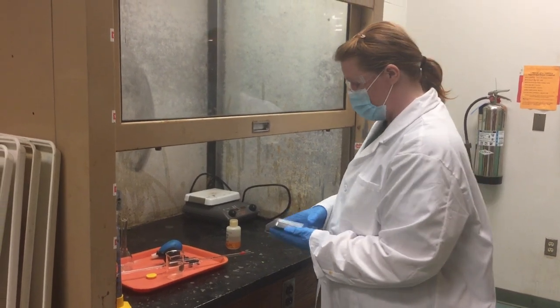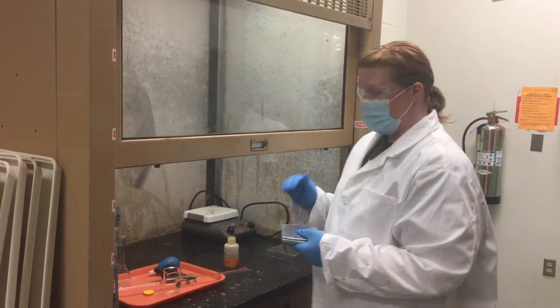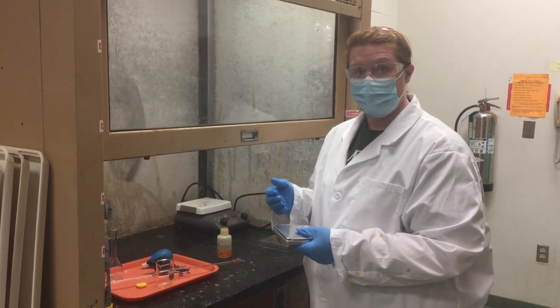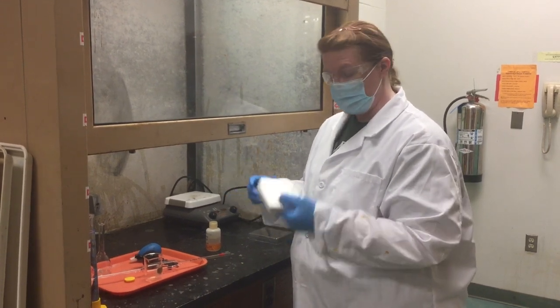You're going to do the acid first. This is actually a stoichiometric calculation because glacial acetic acid is one of the few acids that's actually liquid, and it's 100% acid, so you can compute how many moles — how many grams — and actually weigh it out.